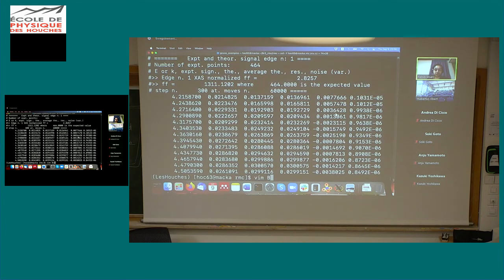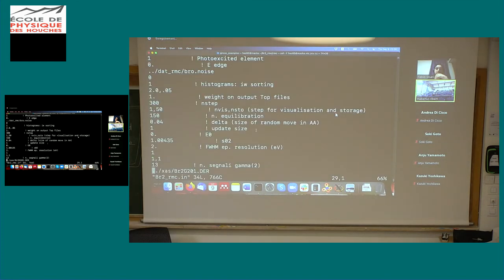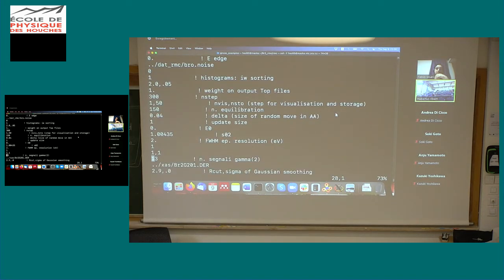Is it also possible to extract the intensities at different configuration points to see how the intensity is evolving? Right now you have the third column as the last accepted configuration. If you have 100 configurations, as a function of configuration, you could see how the intensity is evolving stepwise.